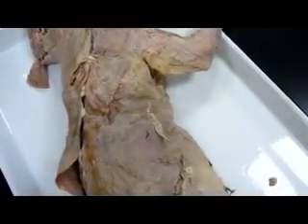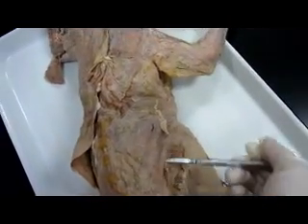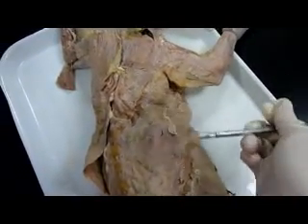And the latissimus dorsi is pretty much this whole thing that I'm lifting up.